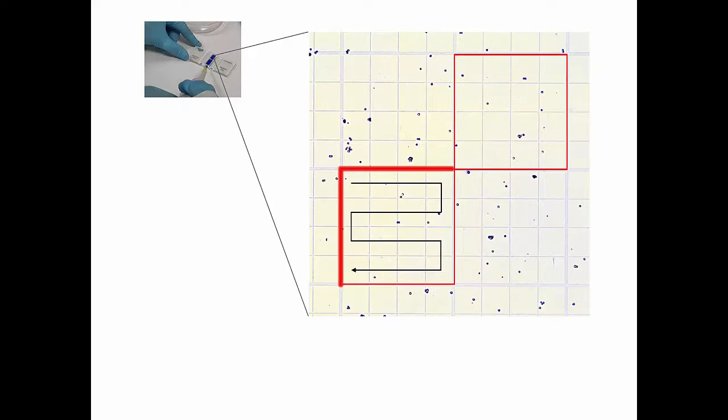Cells touching the lower and right limits should not be taken into account. Count the live and dead cells in five 1 mm² rectangles of the counting chamber. For calculation you will need to combine the counting results from all five squares. For greater accuracy in the measurement additional squares of the counting chamber can also be counted.